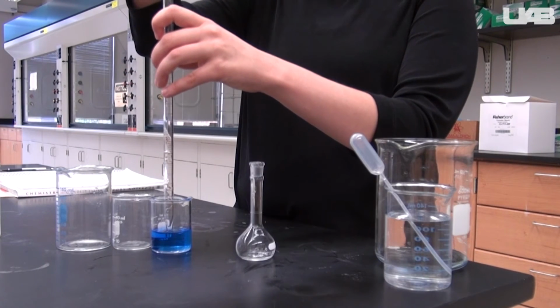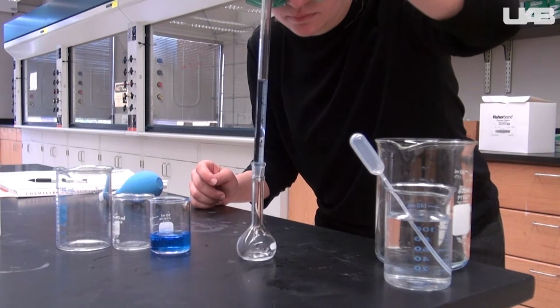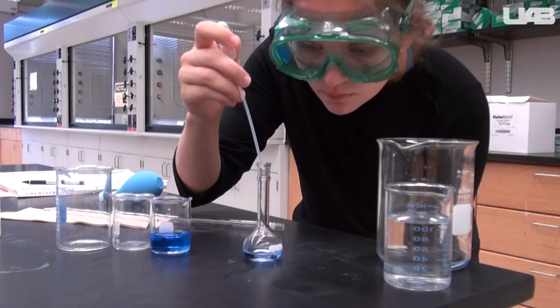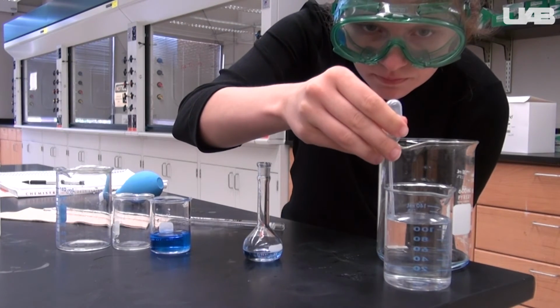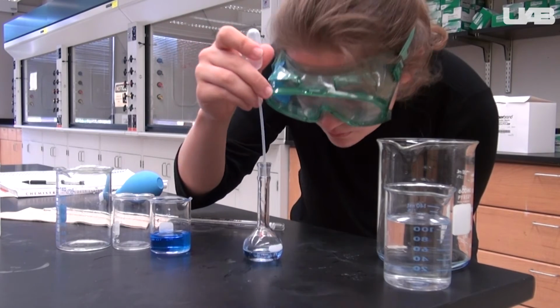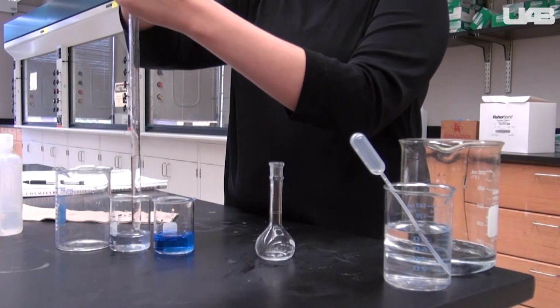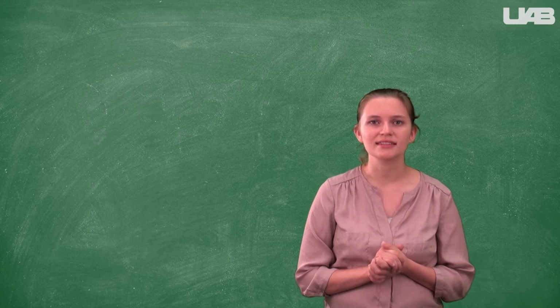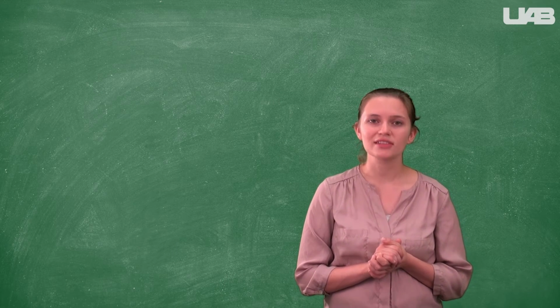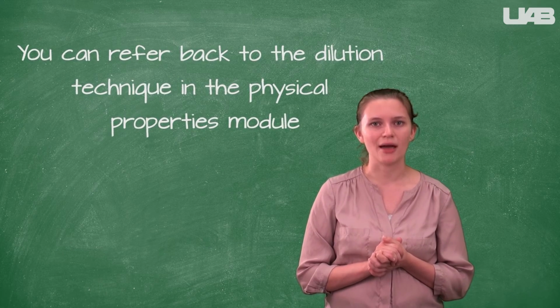Unlike the dilution you performed in an earlier lab where you simply took different volumes from a stock solution, a serial dilution is performed by taking a small volume of the stock solution and making your first dilution. Then, instead of drawing from the stock solution for the second dilution, you will use a small volume from the first dilution. This creates a series of solutions that decrease in concentration. We won't go through the dilution technique again in this video, but if you are still unsure about it, you can reference the technique video from the Physical Properties lab.